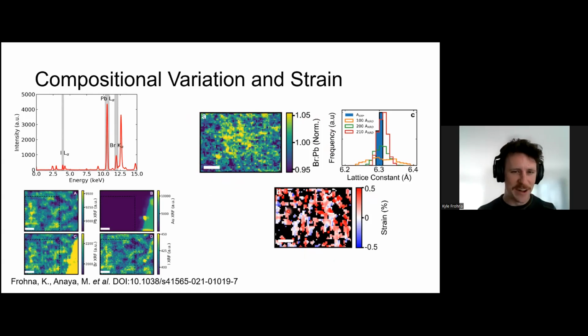So all that being said, I caution myself here. This technique does not make perovskites happy. Let's put it that way. If you blast a very high energy, high intensity X-ray beam at perovskite, it will not thank you very kindly for it. We've done quite a bit of work, and some colleagues in the group have done quite a bit of work, on studying beam damage, and it's very real in this technique. So if you plan to do a multimodal set of experiments, and this is one of them, this should be the last one, because you shouldn't be measuring this device afterwards. That has to be said.